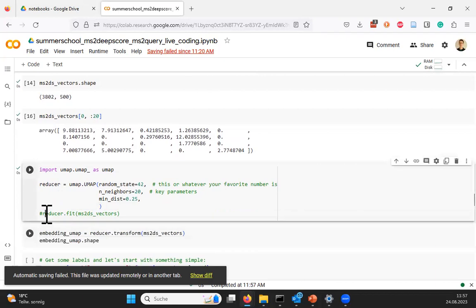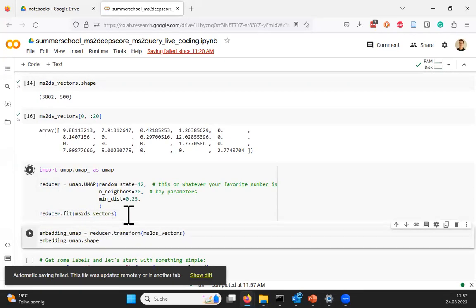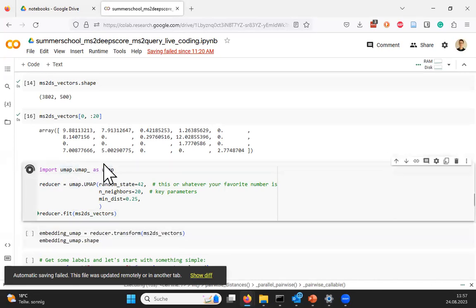And I'm curious if this works because we had some trouble before. This piece of code, so I think in your notebook, it's only import UMAP, which worked yesterday evening for me. It didn't work this morning, so I changed it to this one. If you get an error that says something about numba or NumPy, change it to this line, only the top line.